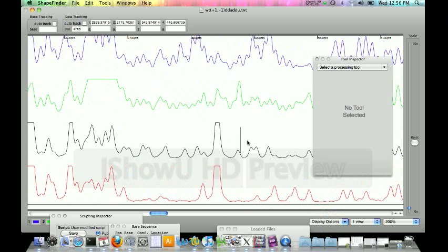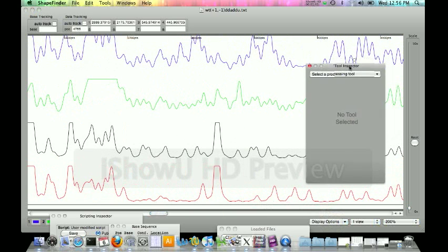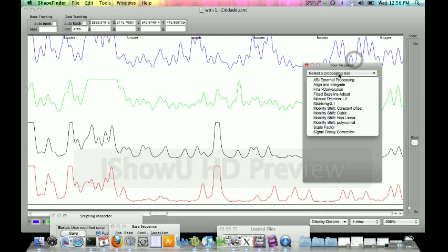The first thing you want to do is take a look at your tool inspector. You see there are plenty of tools to use to help set up your data. The main tools we're going to use are fitted baseline adjust, filter convolution, signal decay correction, and align and integrate. I'm going to go through all those steps in a few minutes.